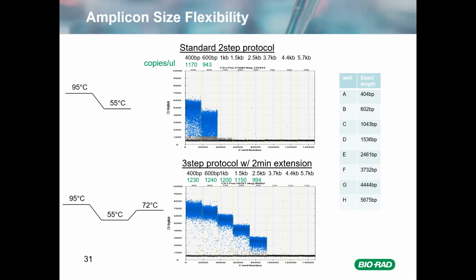We need to be operating around 100% efficiency. As we start to decrease our efficiency, if it gets low enough, the math and our confidence in our results become less reliable. When we start doing these absolute quantification or delta Cq comparisons, the math is not as robust when our efficiency gets below 100%, typically below about 90%.